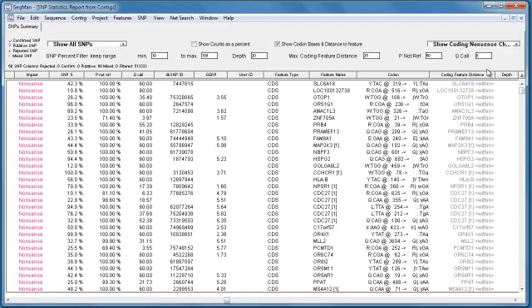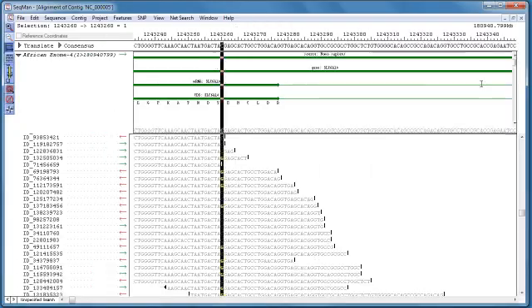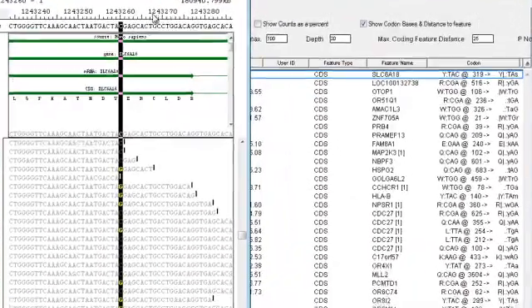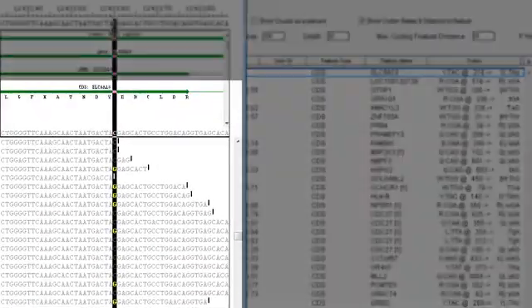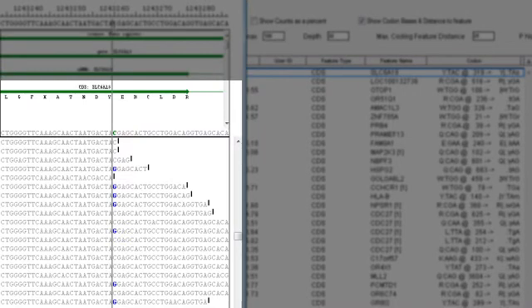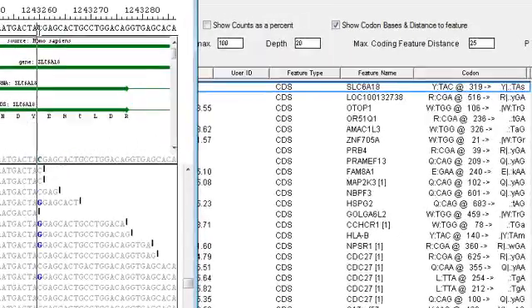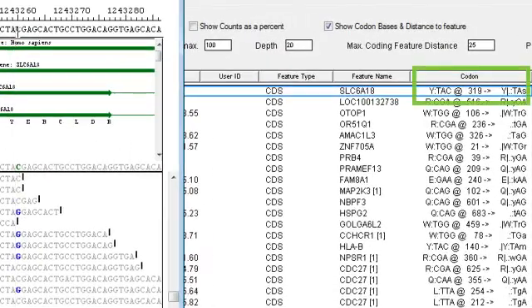We can look at any of these SNPs in more detail by double clicking. This opens the alignment view, and here we can see that this SNP occurs in the middle of a CDS feature and is a heterozygous change from a C to a G that would result in a premature stop codon.